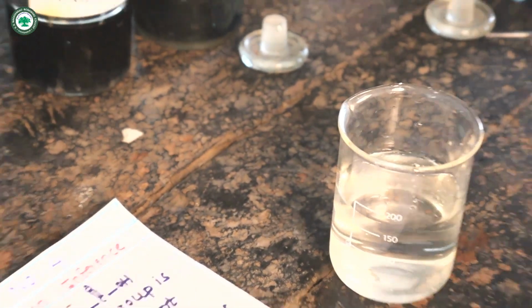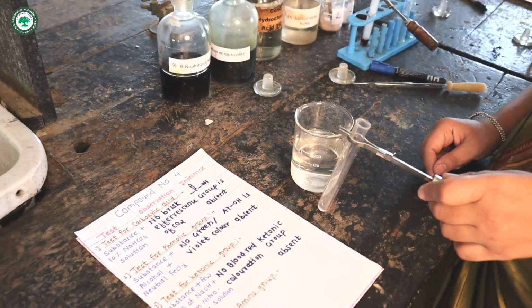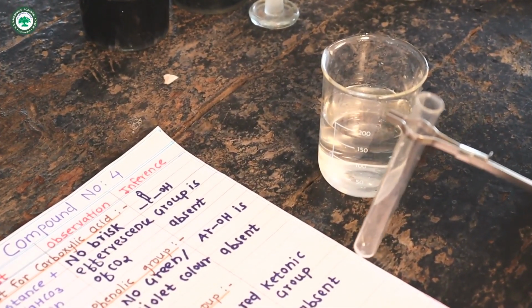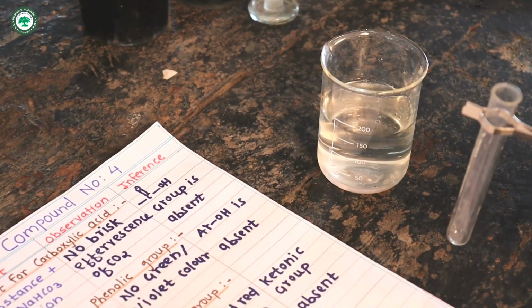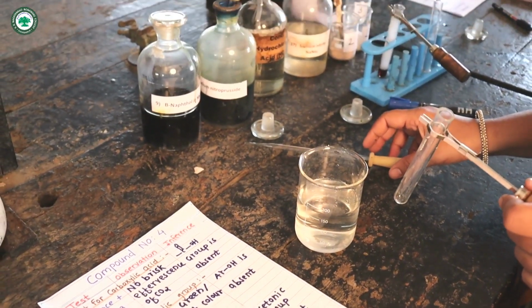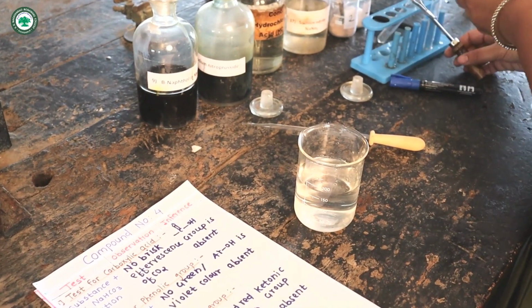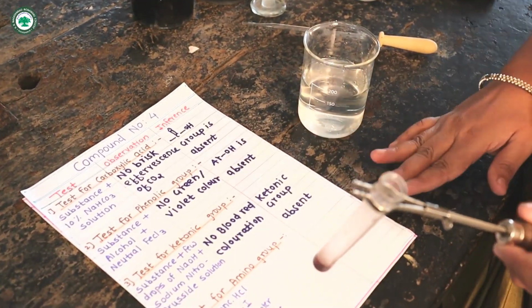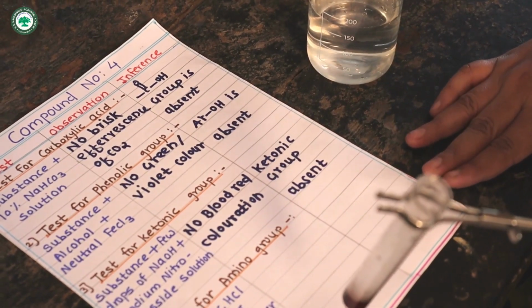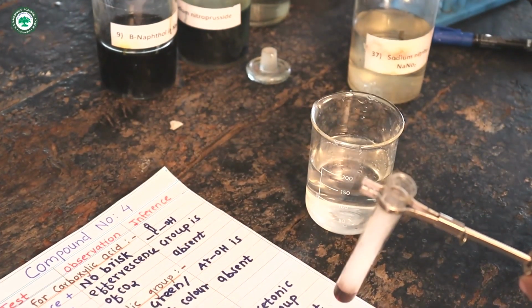Solution is cooled. Then in the second test tube, take beta naphthol in NaOH. In the first test tube, substance plus concentrated HCl, cool under tap water. I have already cooled this test tube. Then add a small amount of NaNO2 solution, that is sodium nitrite.